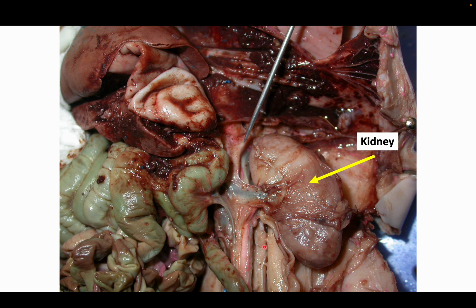So this helps get rid of waste in the fetus. Now, when you do your dissection, you have to lift all of the intestinal organs out of the way. So reminder, this is the stomach, the large and small intestine. Go ahead and lift that out of the way, and then you're going to see the kidney. But before you see the kidney, it's surrounded by a fibrous capsule. It's a very thick tissue, so you have to remove that tissue for you to see the kidney like this. So here's the kidney right here, and then you have another one on the other side.